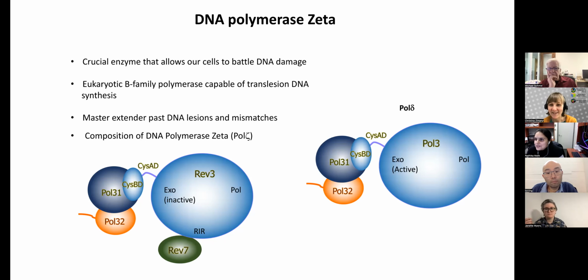I would just use the restraints that you would have for the DNA, and that's how we build the DNA in our lab. We use those restraints that are built in COOT, and those are quite nice actually, and they help in building the DNA quite accurately.